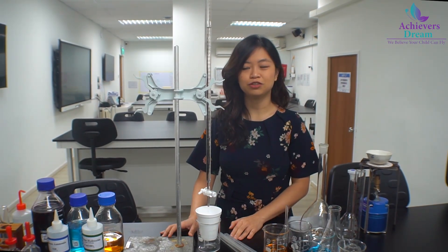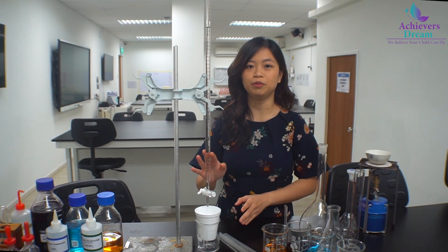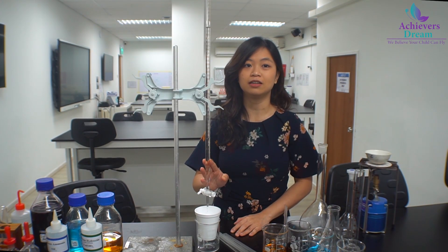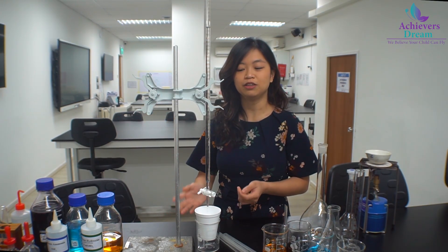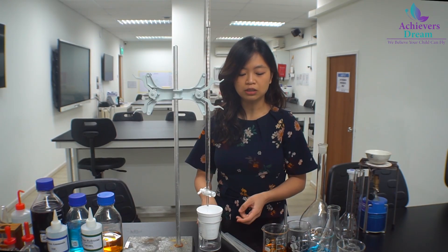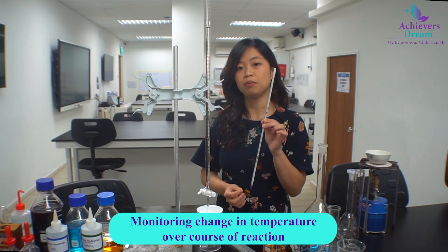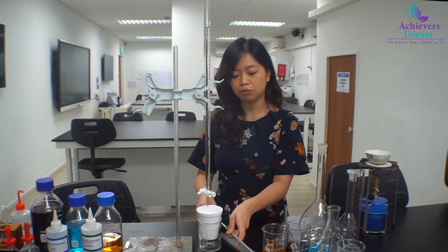Today we are doing a thermometric titration. If you look at the setup in front of me, you can see that we do have a burette like what we are used to using in a titration. However, unlike an acid-alkali or typical titration where we use an indicator, we are not using one here. Instead of an indicator, we are monitoring the change in temperature over the course of the reaction, so we will be using the thermometer to actually monitor this change in temperature.